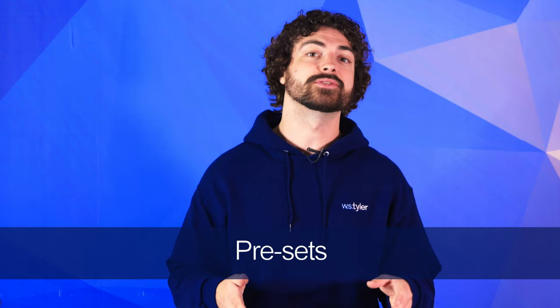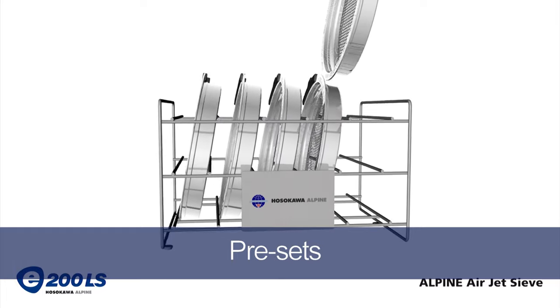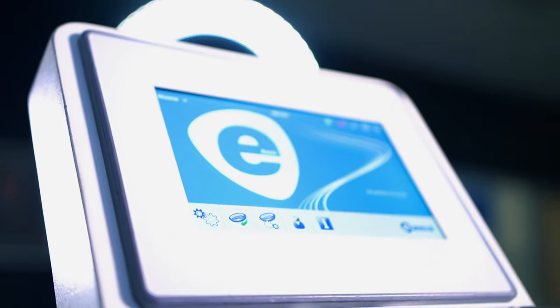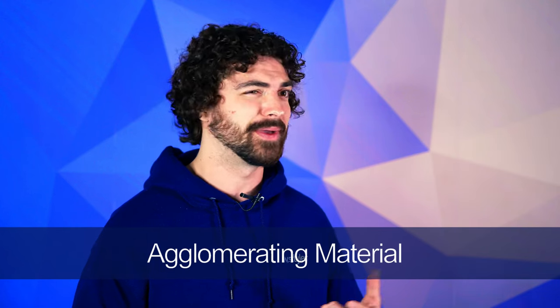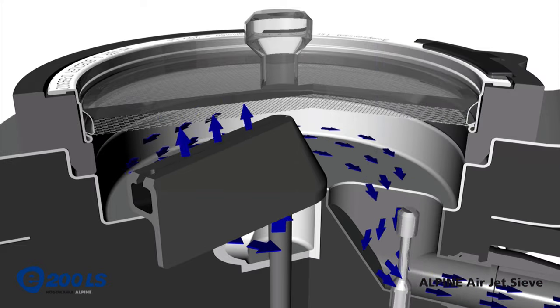The Alpine airjet uses specific test sieves that you can pre-program to each type of material you test in your lab. For instance, if you run charcoal or limestone through your sieve shaker, you can have a preset for each material to remember the exact settings and levels you need. Maybe the biggest reason for using the Alpine is for agglomerating material. The airflow inside an Alpine does a much better job at separating individual particles that tend to agglomerate, compared to the simple rotate and tapping motion from a sieve shaker.